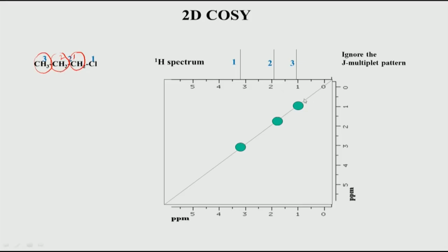So, the 80% that does not go anywhere will evolve during t1, along the vertical axis, in omega 1, with the chemical shift of 1, and it will also evolve with the chemical shift of 1 in this axis, because it has not transferred. Therefore, a Fourier transform gives you a diagonal peak, which has the same chemical shift on both axes. You can look at this picture, both this axis as well as this axis have the same value.